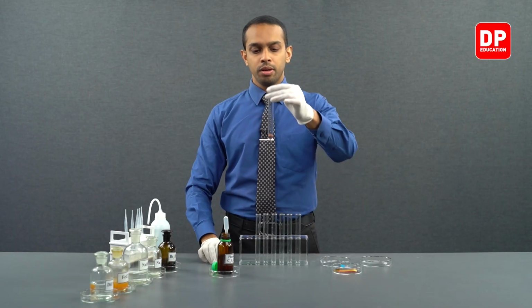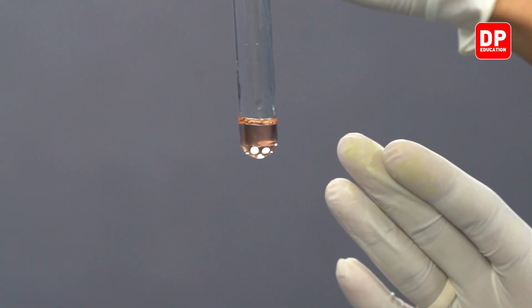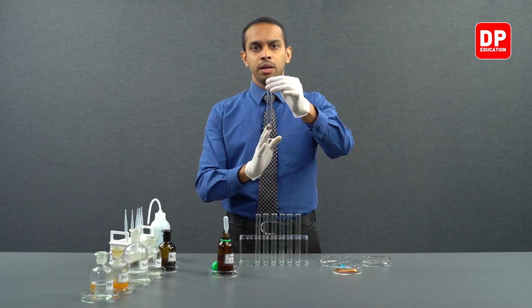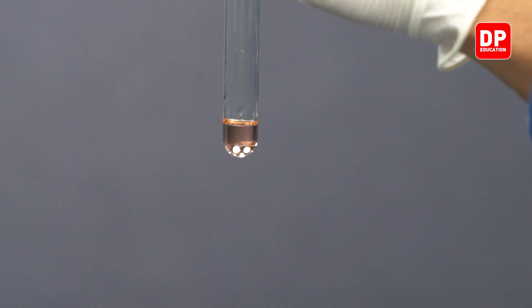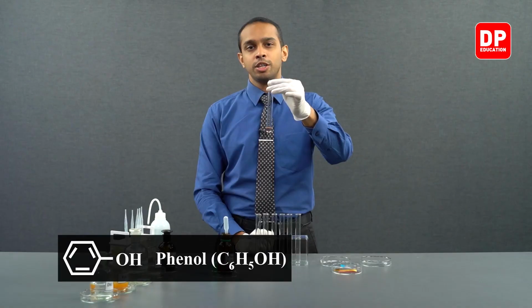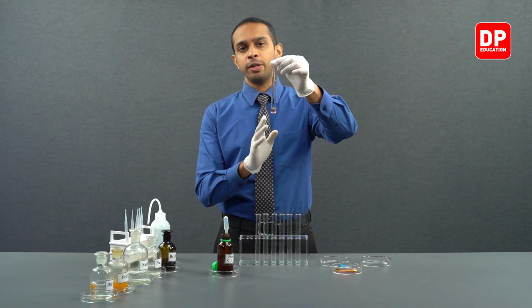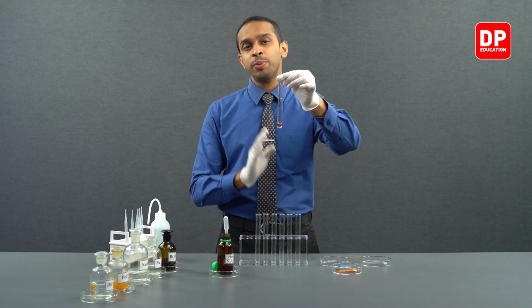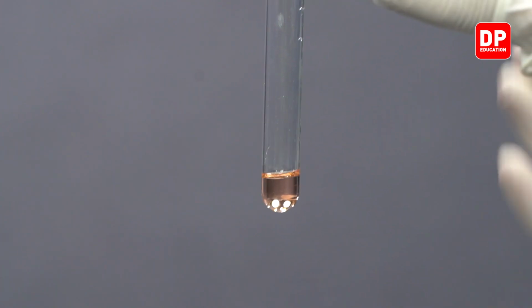This is enough. Now, you will observe the color of the phenol that we have in this test tube is between a pink and a red color. This color is there because the phenol in this test tube is not 100% pure. A 100% pure sample of phenol will appear to be colorless, but if there are any impurities present, the color you will be observing is this pink-red color.